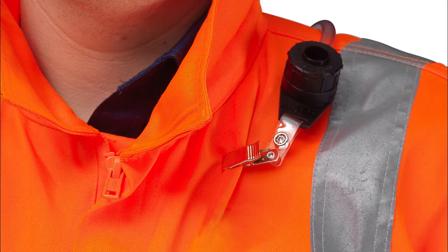The pump is now ready to be worn by the wearer. Ensure the pump is worn securely. The sampling head should be worn in the breathing zone, clipped as close as possible to the mouth.